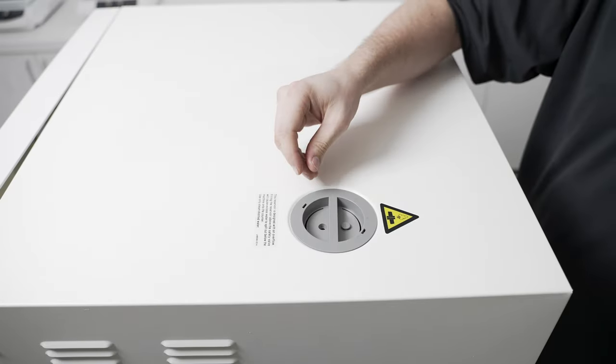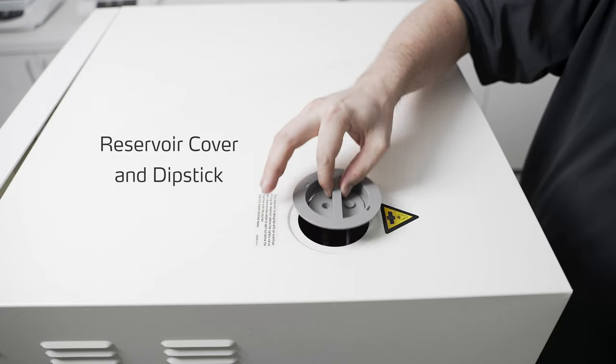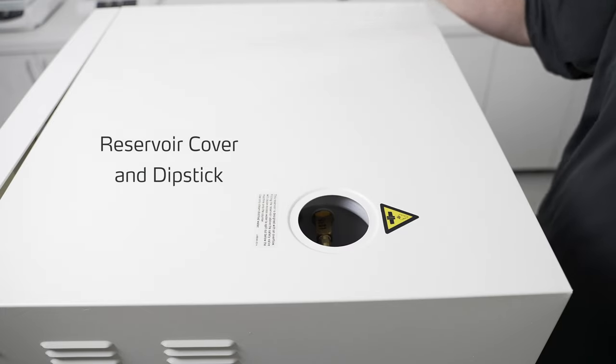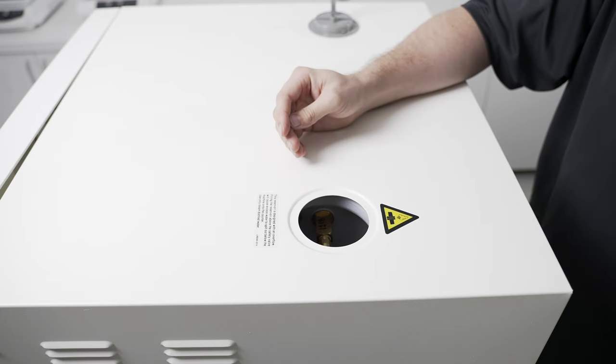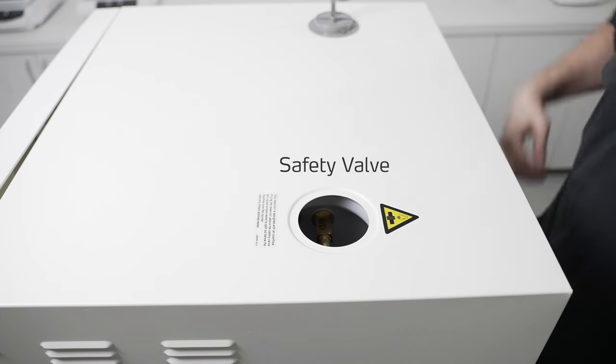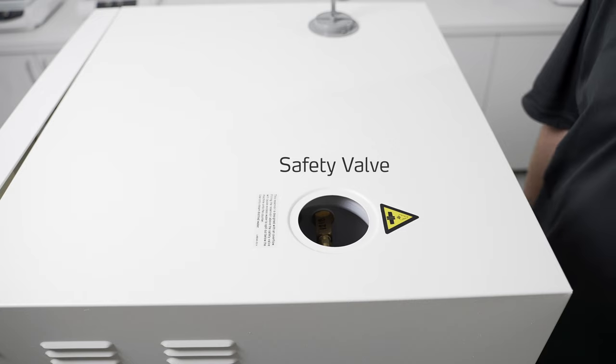Here at the top of the autoclave we have the reservoir cover as well as the dipstick for monitoring the water level in the reservoir. Inside the reservoir you'll also find the safety valve for helping prevent over pressure situations inside of the chamber.